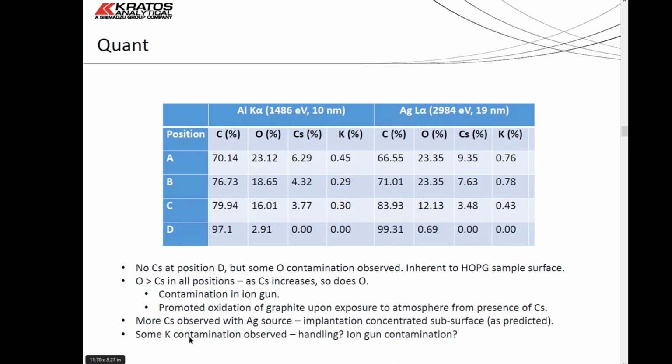So we analyzed basically in all 90 locations to get that concentration distribution. Here are 4 locations in particular, because I don't want to show you all the data fitted. But you can see you already start to mount up a lot of information when you propagate through a fitted model of a survey scan. You end up with tables like this, which are really difficult to understand, because it's difficult to see the relationships there.